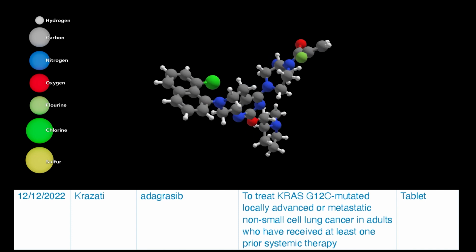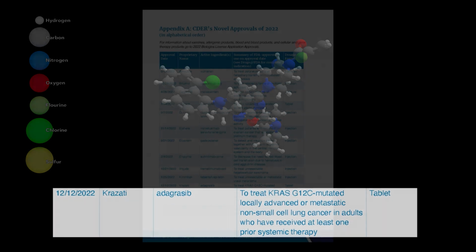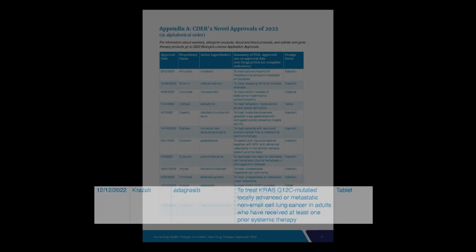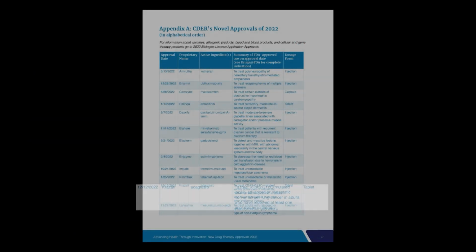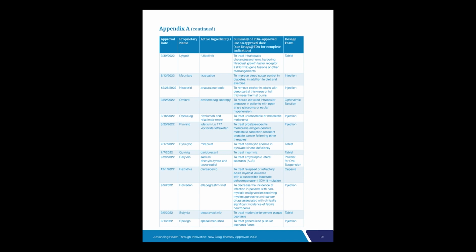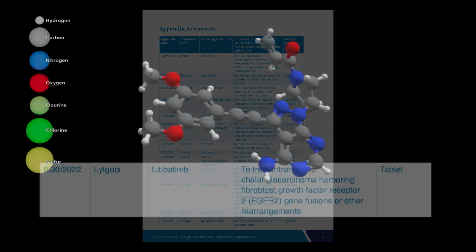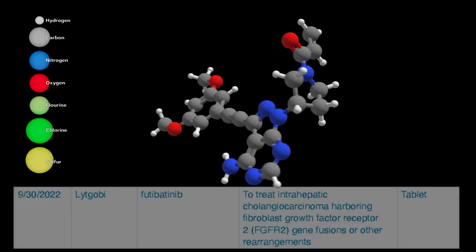Step 2. For purification and isolation. Once lead compounds are identified, HPLC is employed for the purification and isolation of these compounds from complex mixtures. By utilizing appropriate stationary phase column packings and mobile phases, HPLC separates the desired compounds from impurities, facilitating further characterization.